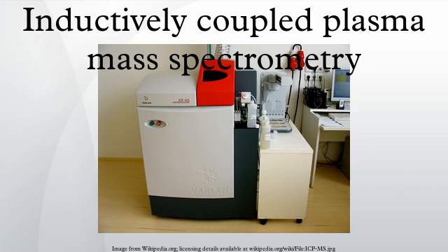However, analysis by ICP-MS is also more susceptible to trace contaminants from glassware and reagents. In addition, the presence of some ions can interfere with the detection of other ions. The variety of applications exceeds that of inductively coupled plasma atomic emission spectroscopy and includes isotopic speciation. Due to possible applications in nuclear technologies, ICP-MS hardware is a subject for special exporting regulations.